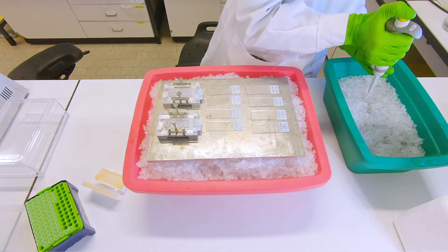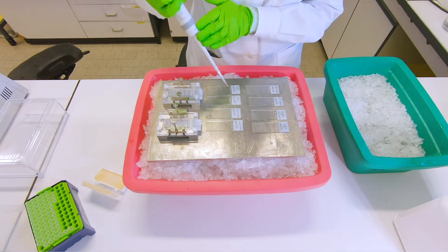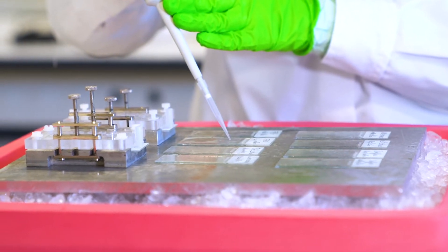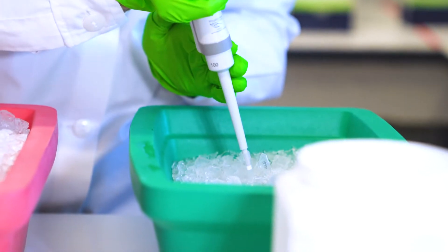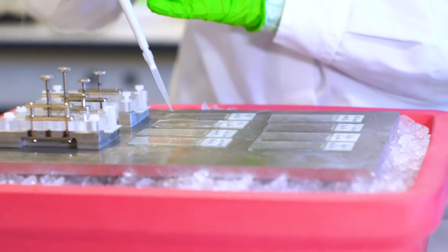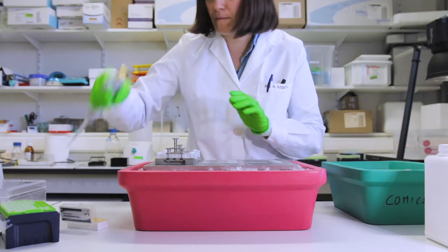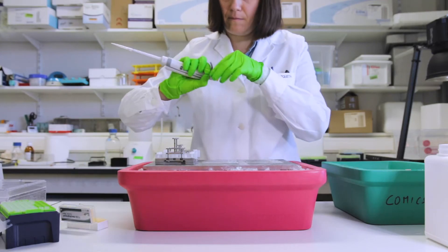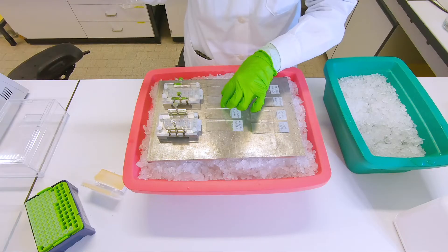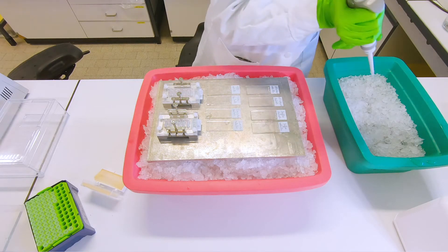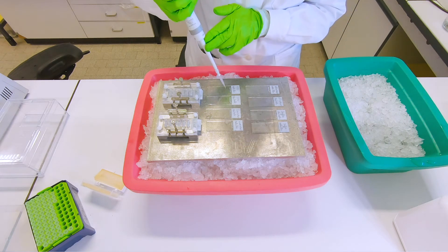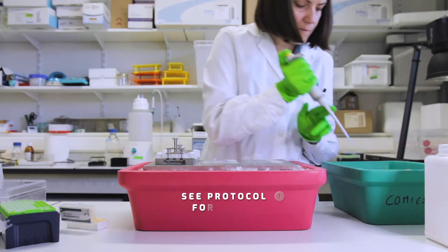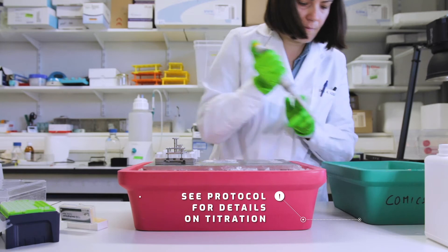So next we have our assay control which is FPG. And also for FPG, when you buy it from a commercial place or if you get it self-made, you always have to titrate and figure out your own dilution which works best for you and gives the best specificity.